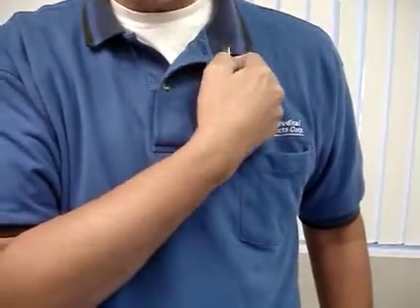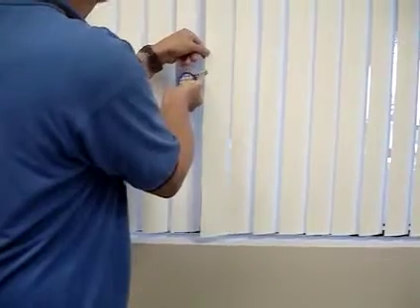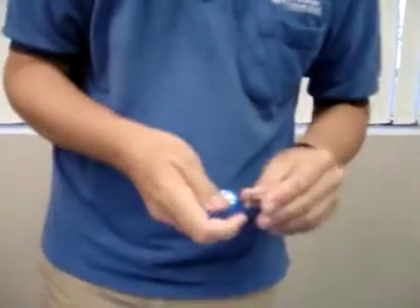If you want to use the monitoring badge as an area monitor, then put it in the area. You can attach it to the wall, near a sterilizer, near the equipment, whatever the case may be. Attach it to a piece of tape and then put that piece of tape onto wherever you want to test.